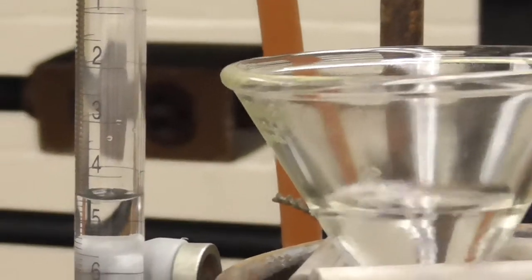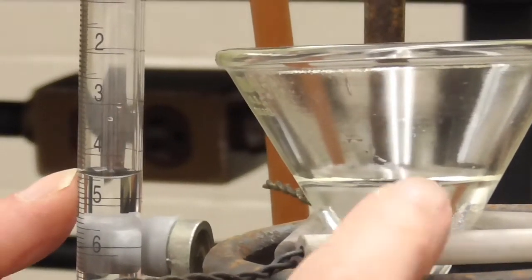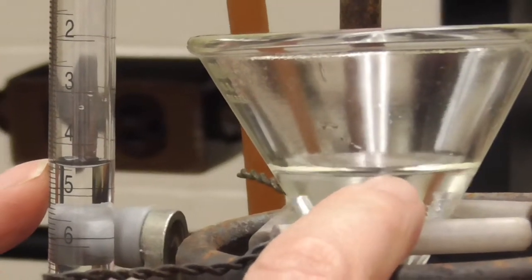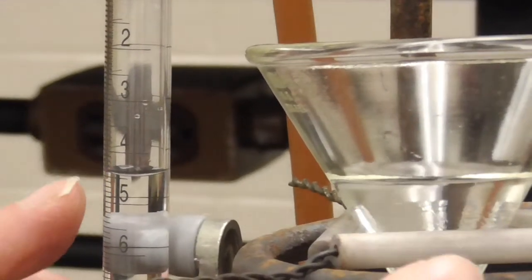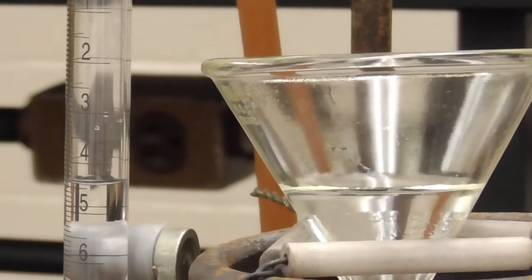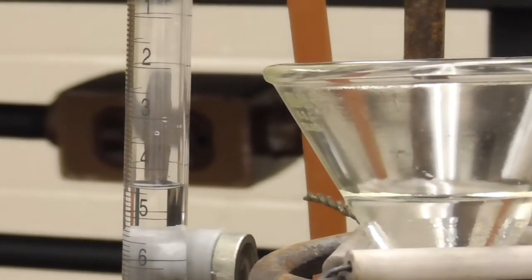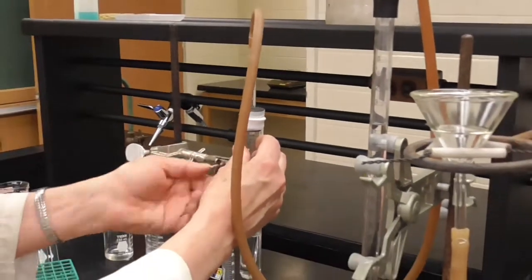This is about as well as I can observe it at this point, but it looks like the level in the burette is level with the funnel outside, which tells me again that the pressure inside of the apparatus is the same as the pressure outside, which I mentioned earlier what the pressure was. So now that we've leak tested it, we are ready to start the reaction.